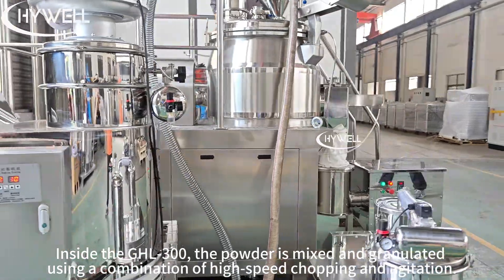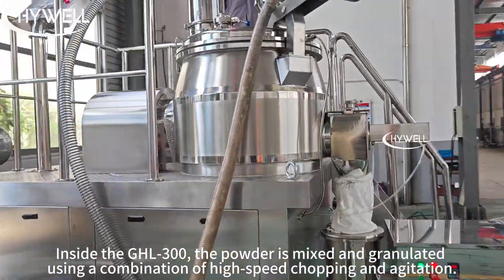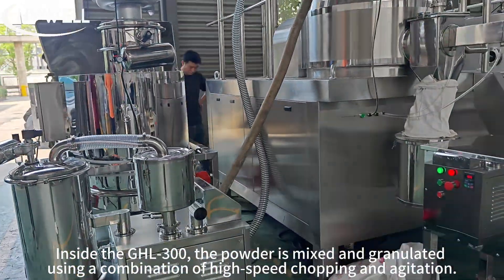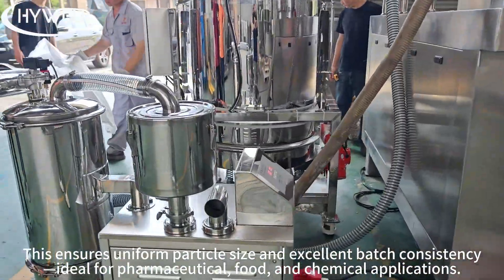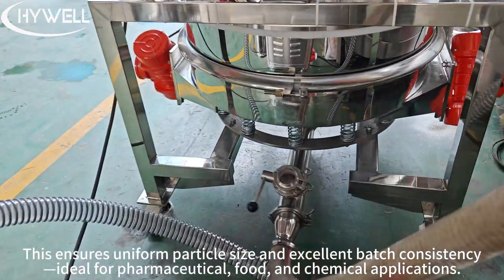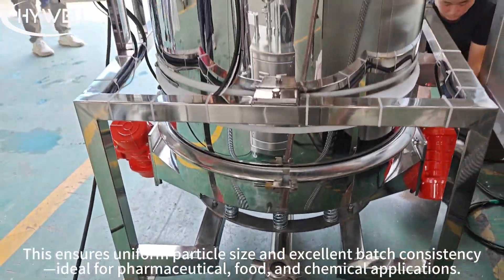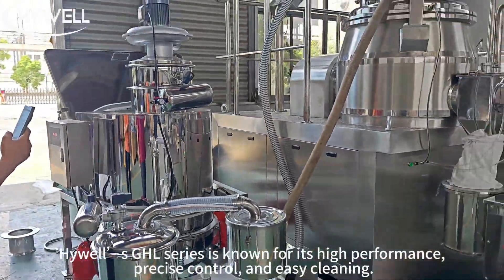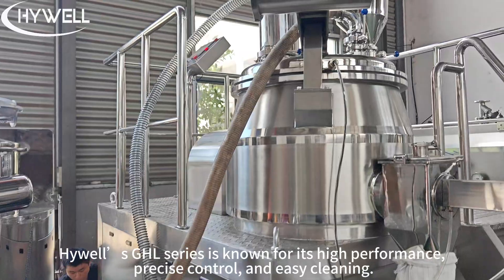Inside the GHL300, the powder is mixed and granulated using a combination of high-speed chopping and agitation. This ensures uniform particle size and excellent batch consistency. Ideal for pharmaceutical, food, and chemical applications, Highwell's GHL series is known for its high performance.